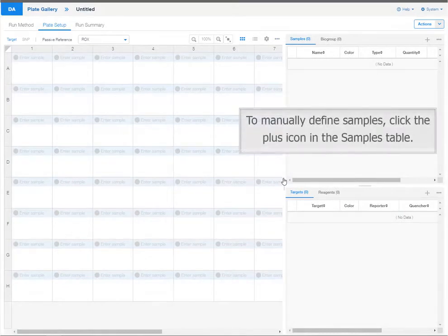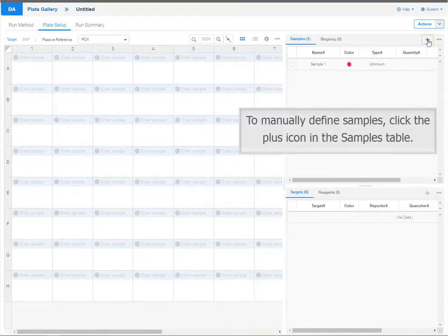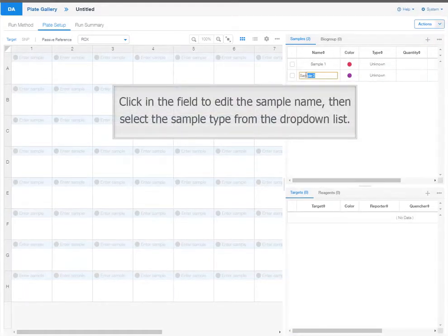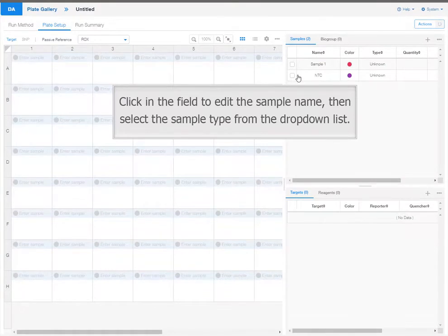To manually define samples, click the plus icon in the samples table. Click in the field to edit the sample name. Then select the sample type from the drop-down list.